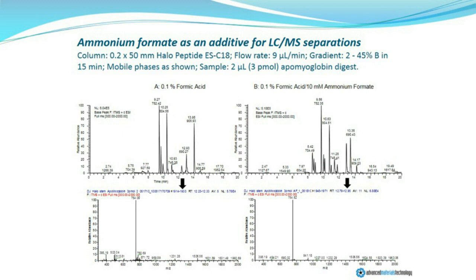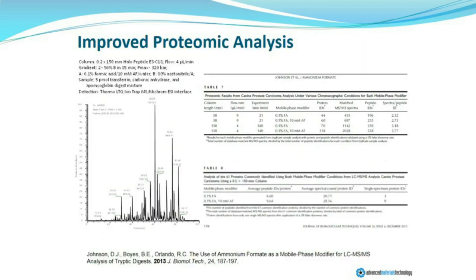So a relatively modest change in terms of the conditions, but the net effect is an improvement in the chromatographic separation part of the LC-MS experiment. Now, protein chemists, like many biochemists, are fairly conservative people, and that might be a nice example, but we needed to go through and produce a more fulsome proof statement on this.